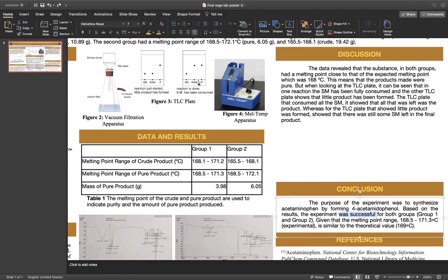No, I included the data for those on one of the pages on web courses within the module. I didn't actually run it on that TLC plate, but the Rf values, you can include it in a table with Rf values, and next to it you could put the image, or not put the image at all as well, that's fine. Or you could do what this group did and kind of draw them in. Okay, thank you. You're welcome.